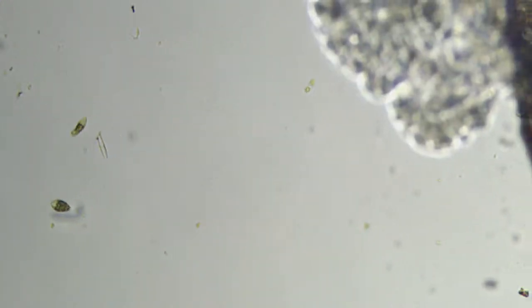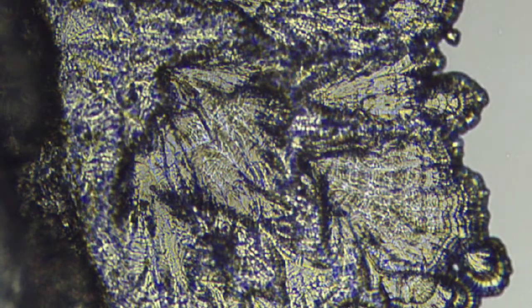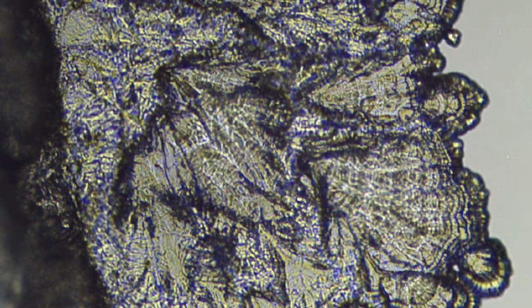Not much else. There's some nice crystals. Look at that. You get some polarization effects there, some colors coming off the crystals at different angles. That's another trick I need to do in a future stream, using polarized light with crystals. Right now I'm getting it because they're growing at different angles, so it's kind of doing it for me. But you can encourage this with proper polarized filters in the scope in a certain way. It's a trick you can do.